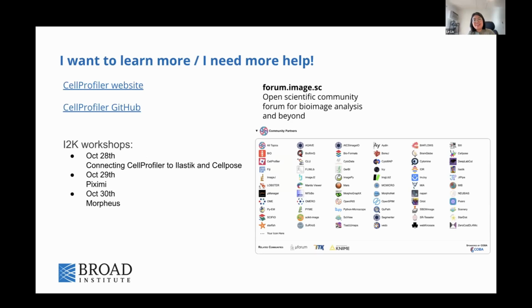I think here I want to conclude our presentation. It's just an overview of how a beginner can use CellProfiler, and you can find more information to suit your own experiments. You can go to the CellProfiler website. There are a lot of videos and tutorials there, and a lot of documentation as well for your own purpose and also for your exploration.